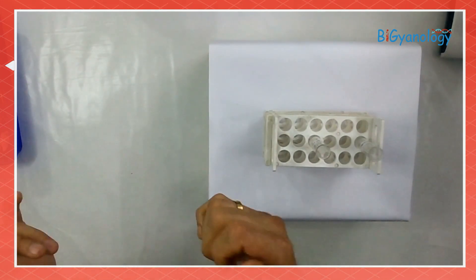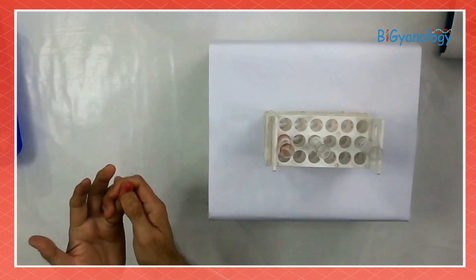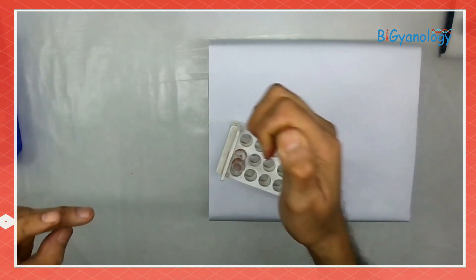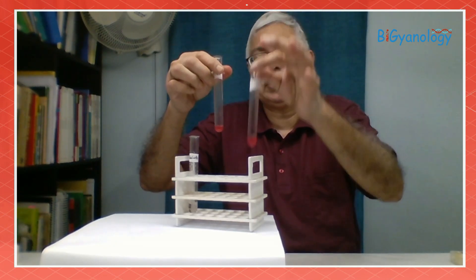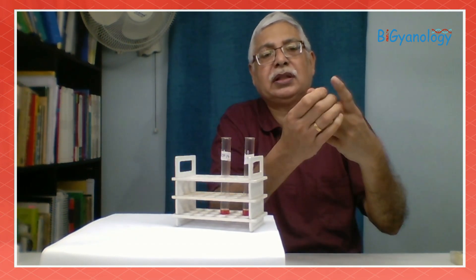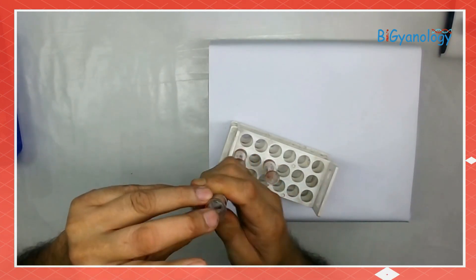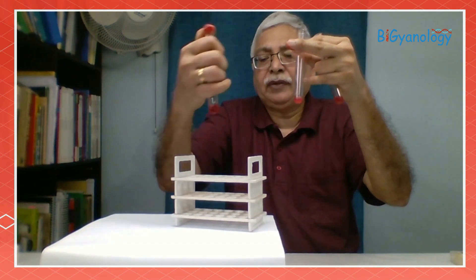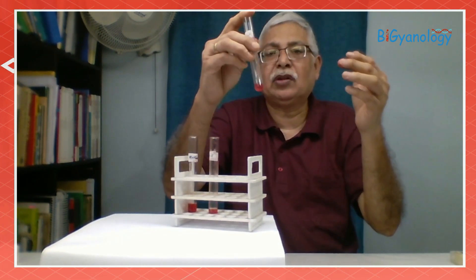I am mixing blood with the 0.9% NaCl, then again giving blood in 5% NaCl. This is normal saline, this is 5% NaCl. Now I am giving blood in the distilled water. I now have three test tubes — one with distilled water, one with 5% NaCl solution, and one with normal saline that is 0.9% NaCl.